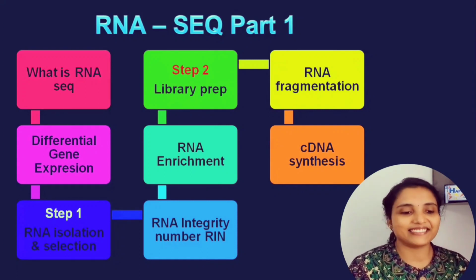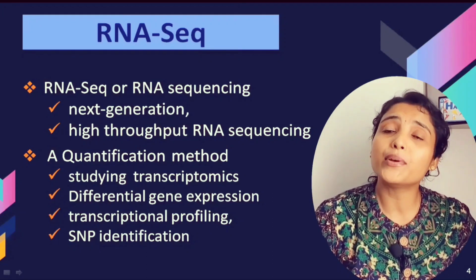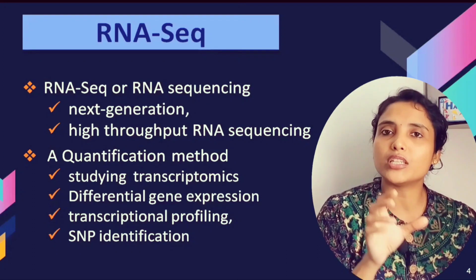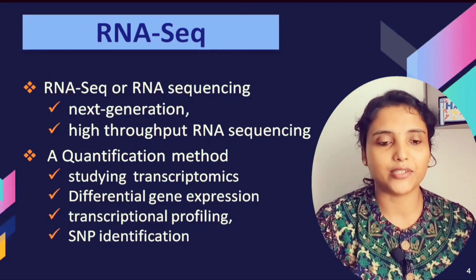Okay, so let's begin. So what is RNA-seq? So RNA-seq, as the name suggests, is a sequencing method for sequencing RNA. That means we are going to find out the order of nucleotides in a particular RNA sequence. Okay, so it's a next generation high throughput RNA sequencing method.